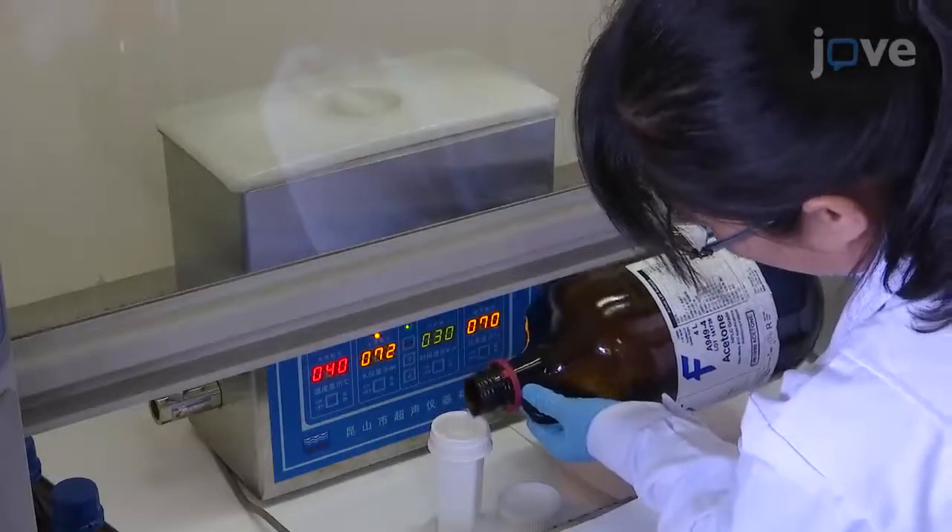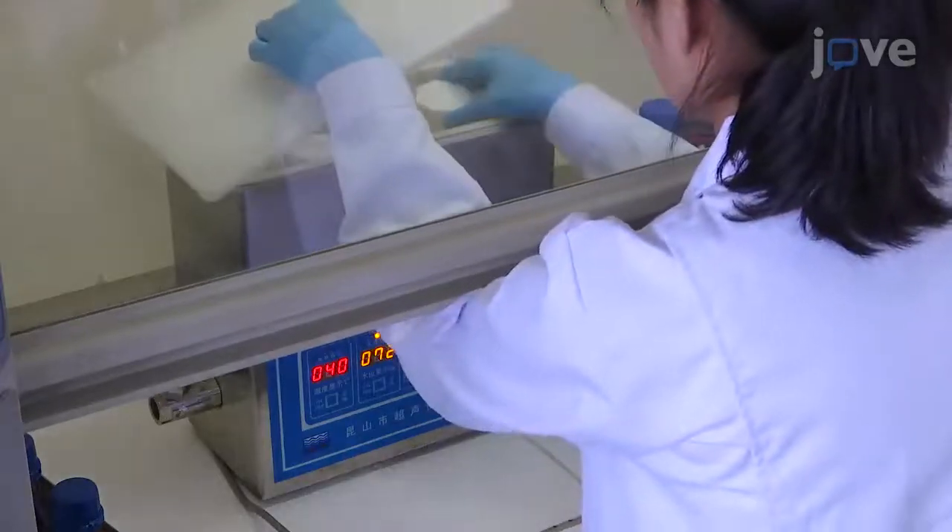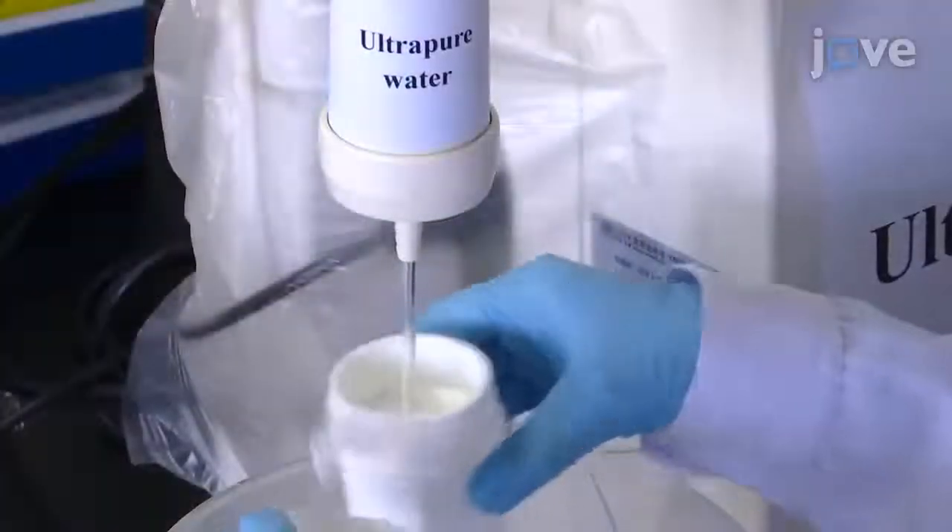Sonicate the coverslips with acetone for 30 minutes, and then thoroughly rinse with ultra-pure water.